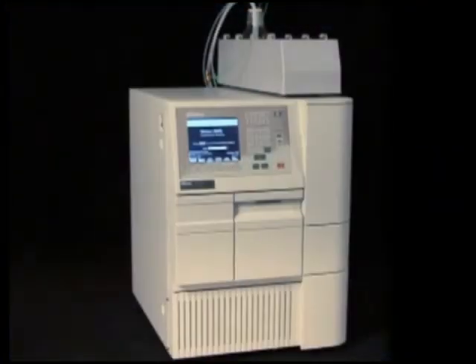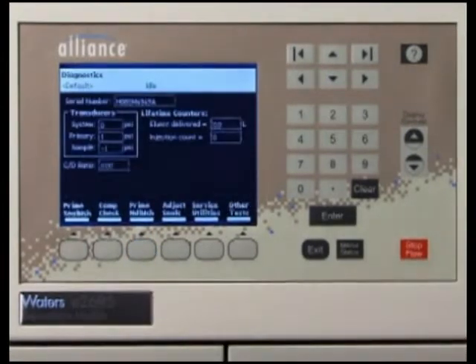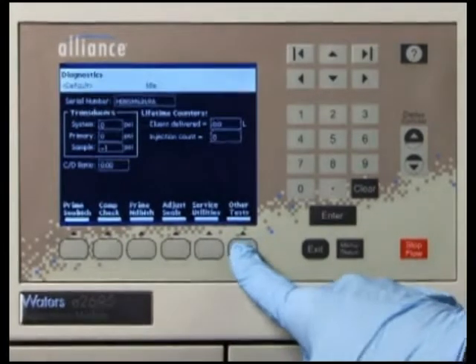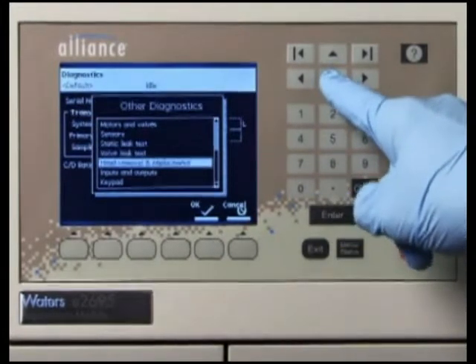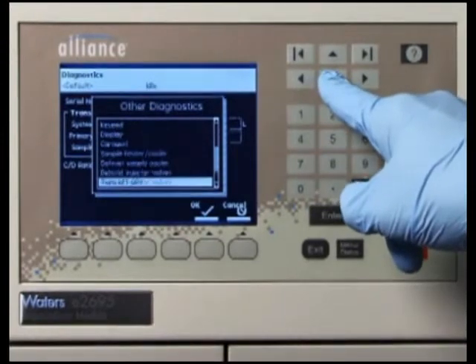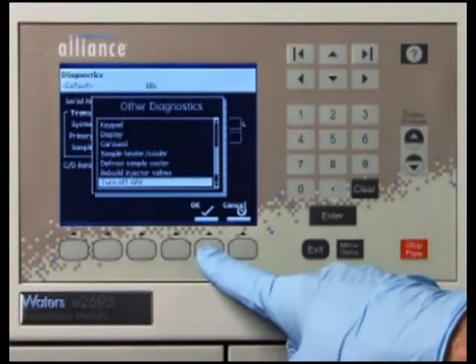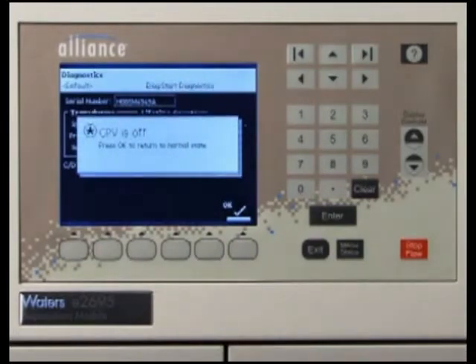Before performing this procedure, ensure that the gradient proportioning valve is turned off to prevent siphoning of mobile phase. To do this, press the Diagnostics key from the 2695 main screen. The Diagnostics screen appears. Next, press the Other Tests key and select Turn off GPV from the list. Then press OK. A message box appears indicating that the gradient proportioning valve is off.